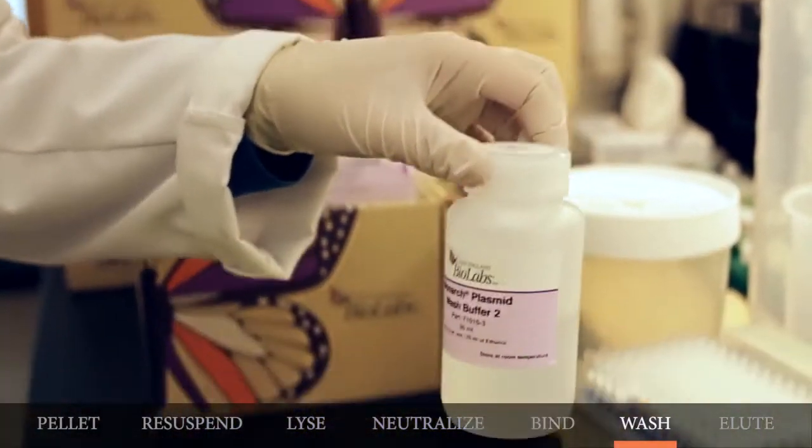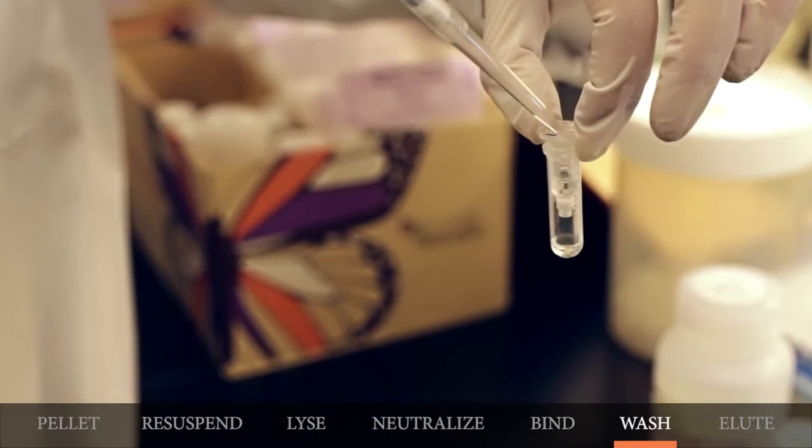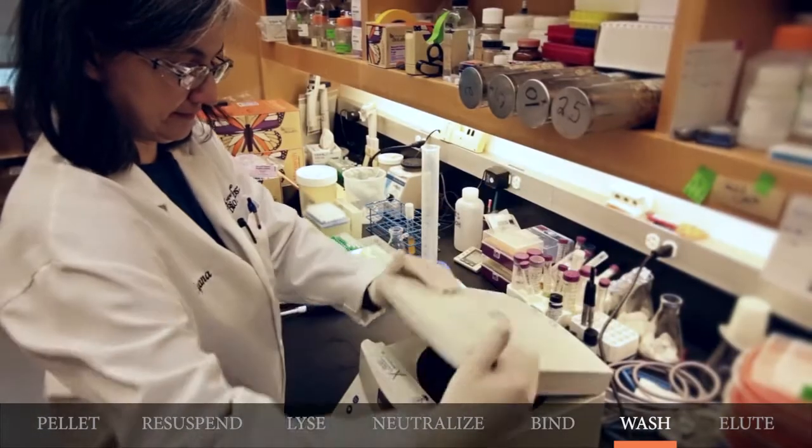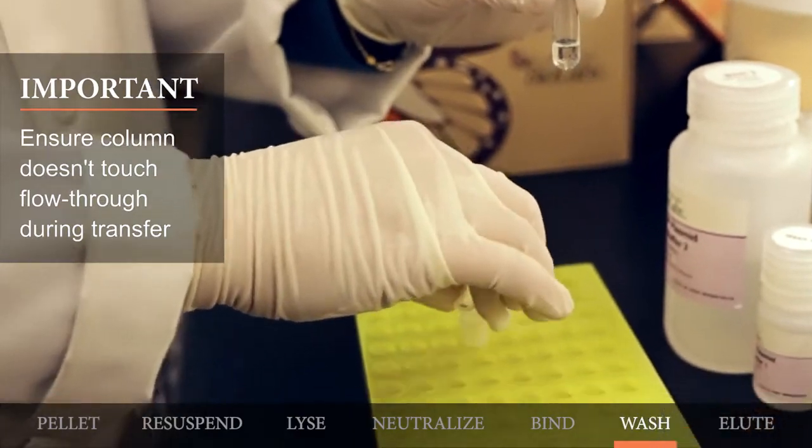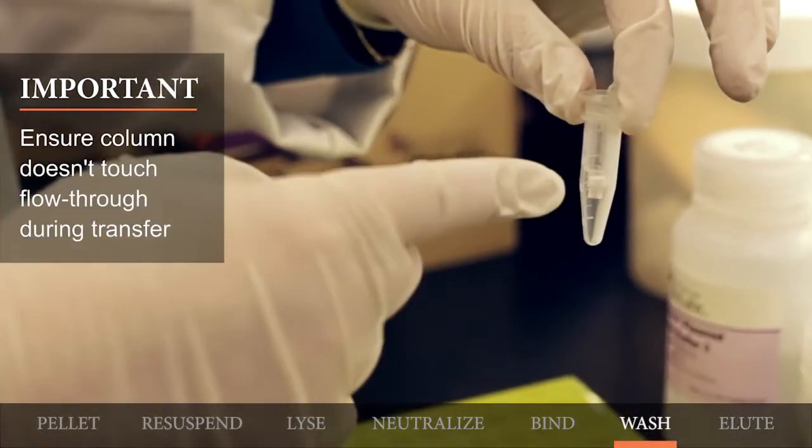Now add 400 microliters of the Plasmid Wash Buffer 2 and centrifuge for one minute. You will transfer the column to a clean microcentrifuge tube, making sure that the tip of the column does not come into contact with the flow-through.